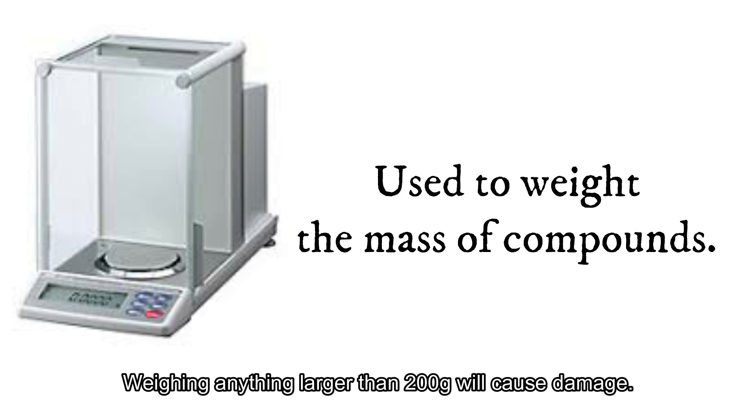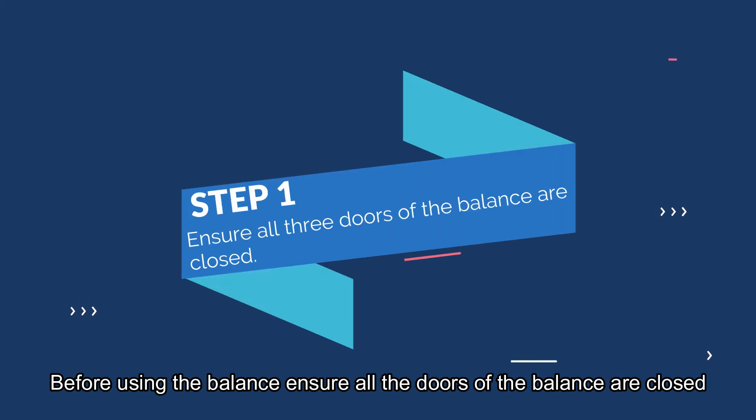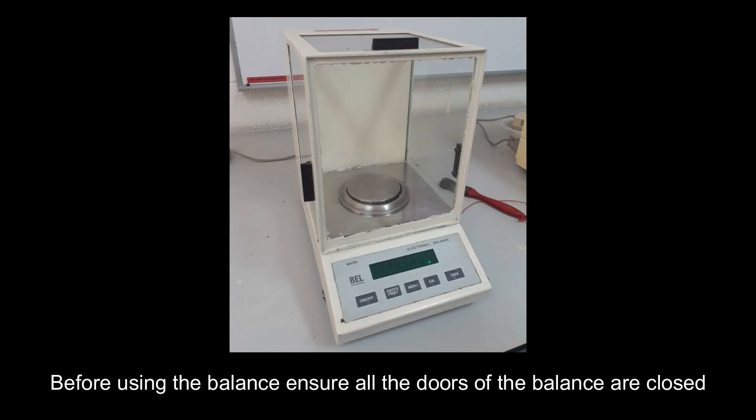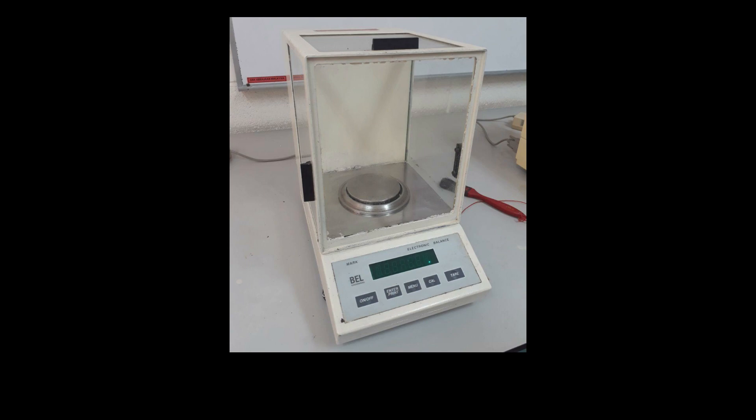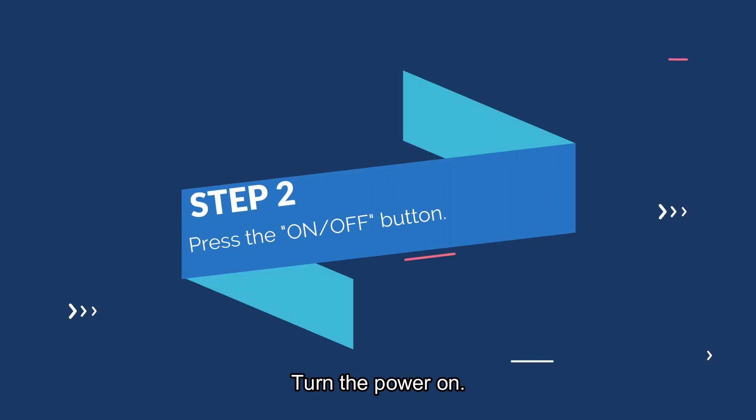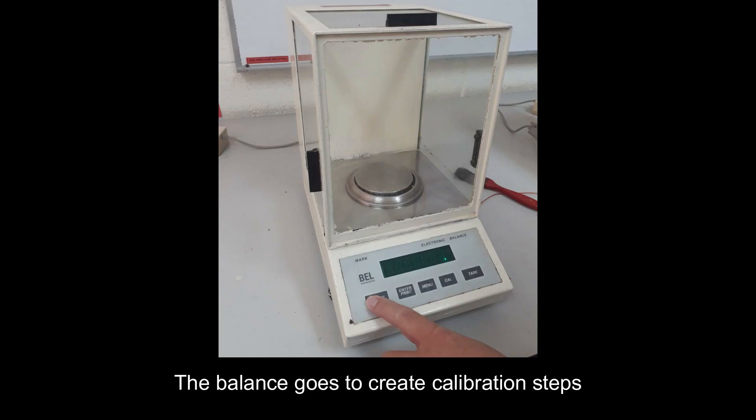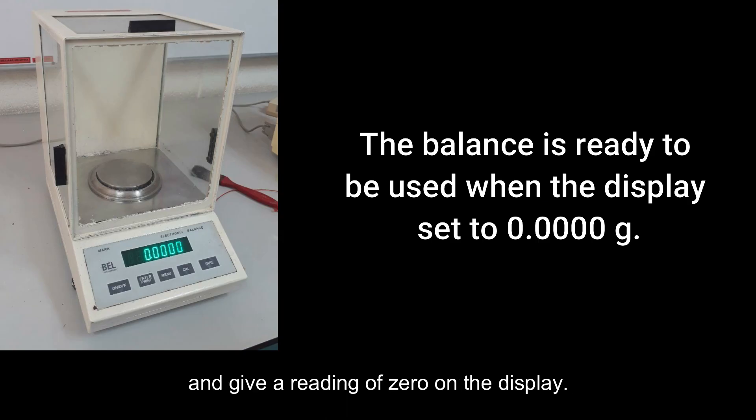Weighing anything larger than 200g will cause damage. Before using the balance, ensure all the doors of the balance are closed. Turn the power on. The balance goes to quick calibration steps and gives a reading of 0 on the display.